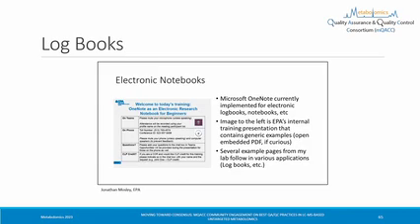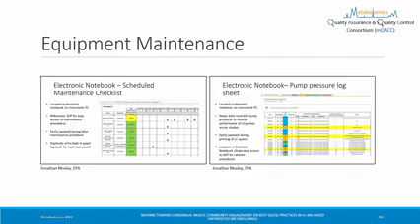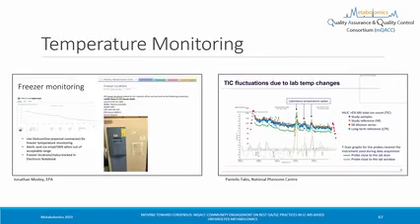Okay, so from my colleague to the left, Jonathan Mosley here from the EPA, works for the government, and has electronic notebooks in OneNote, totally accessible, okay? So I want to make the point that it doesn't always have to be fancy stuff. For his equipment maintenance, it's right in OneNote, and this is how Johnny runs things in the EPA. This is entirely achievable by everyone in the room, no problem. So don't think that solutions have to be these fancy in-house things.